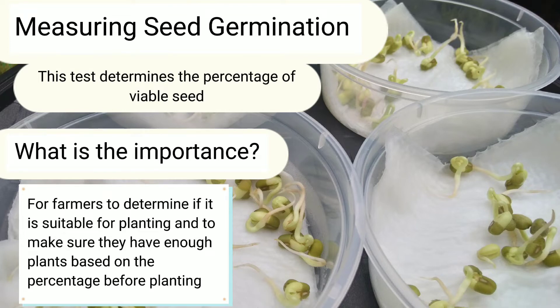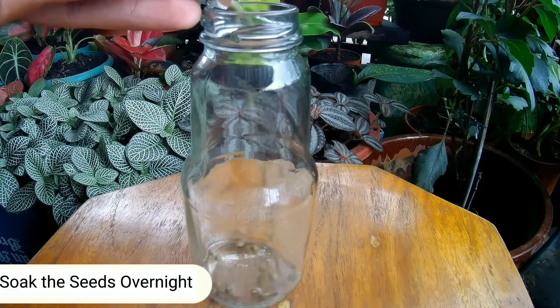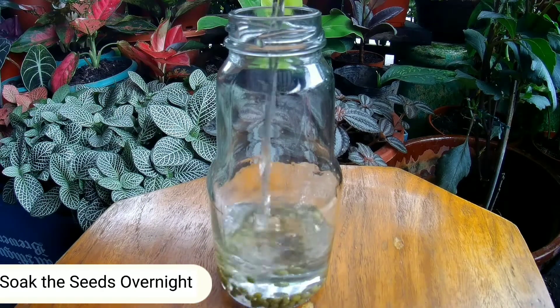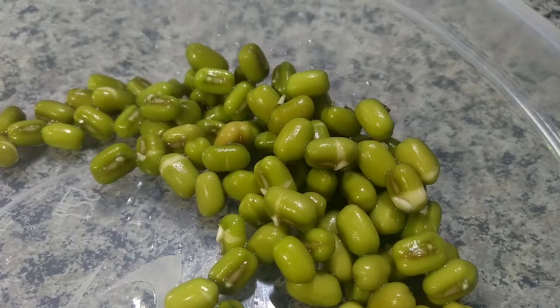Measuring seed germination. This test determines the percentage of viable seed. The importance: for farmers to determine if it is suitable for planting and to make sure they have enough plants based on the percentage before planting.